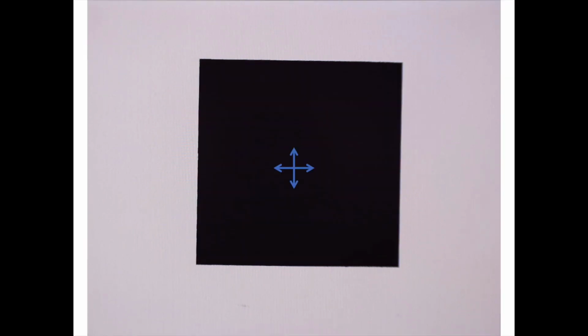Our other important viewing configuration for our polariscope involves an upper polarizer. And this upper polarizer is oriented so that the vibrational direction of light that would be allowed to pass through it is actually perpendicular to our initial plane polarized light. As such, no light ends up passing through it, and it appears dark in this image.